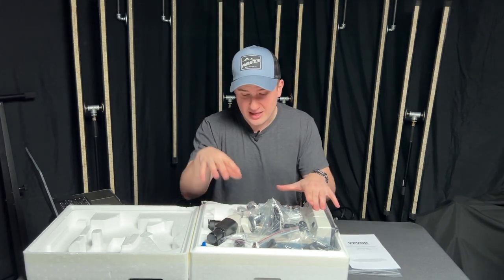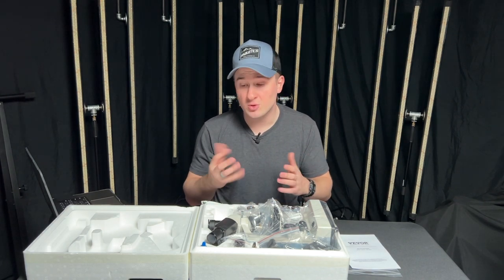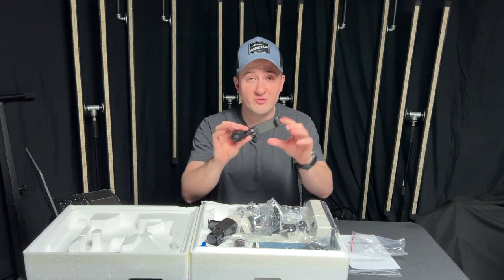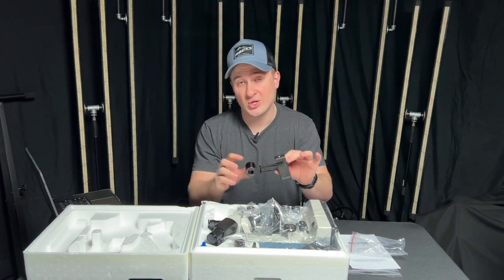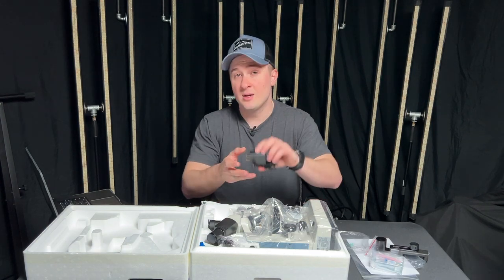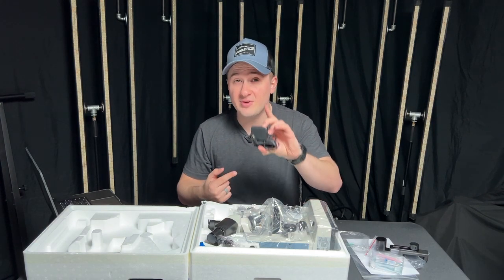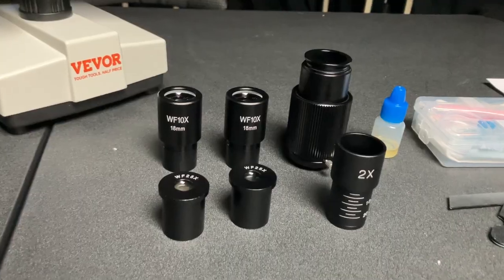Inside the package you've got the microscope itself as well as a bunch of different lenses and accessories that will help you get the most out of the microscope. The microscope also features this handy phone mount which you can attach to actually take pictures of what you're looking at through the microscope. There's a bunch of accessories included with this kit as well. Now the microscope is wall-powered via an AC plug. We'll set that aside and we're going to go ahead and pull everything else out of the packaging.